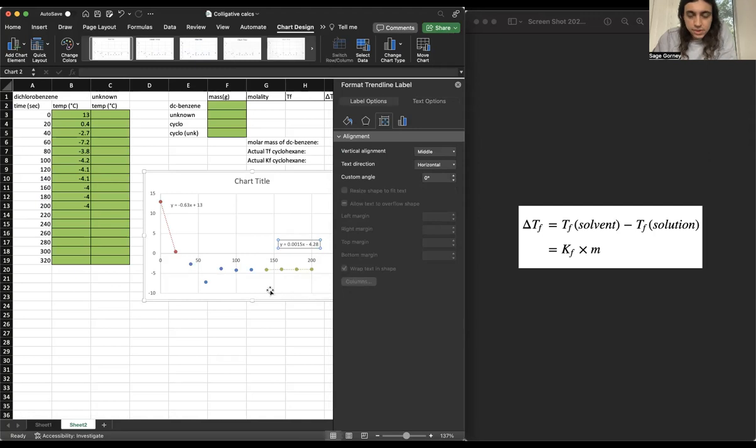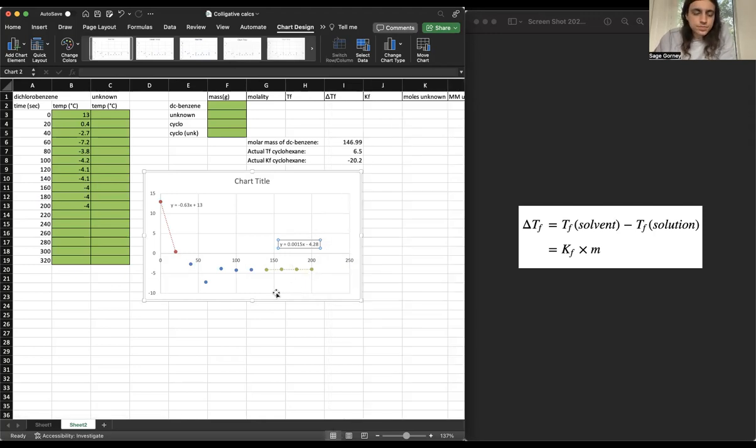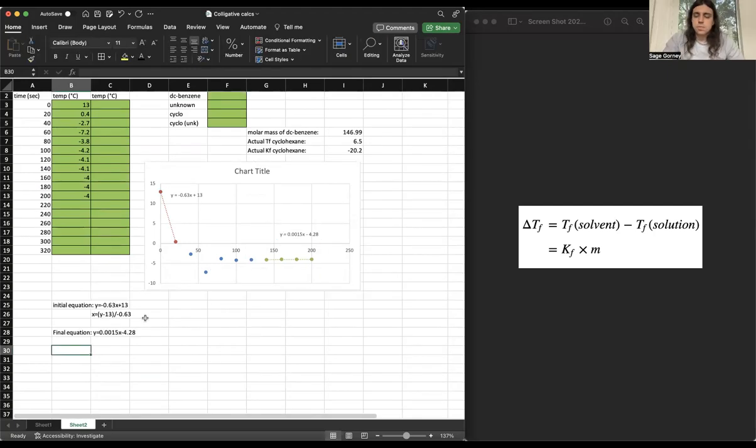Awesome. Okay, so now we have the equations for both series of our data. Now what do we do? Well, we want to find the point where these lines meet, because imagine these lines extending farther out. They're going to meet somewhere over here. At this point, it might be helpful to identify what our M's and B's are in these equations here.